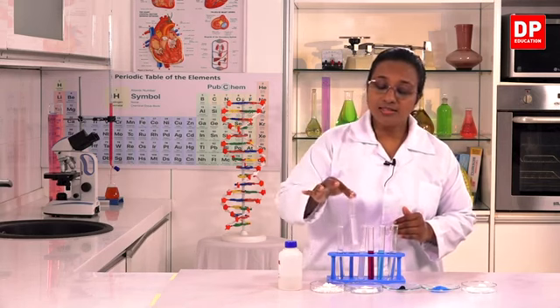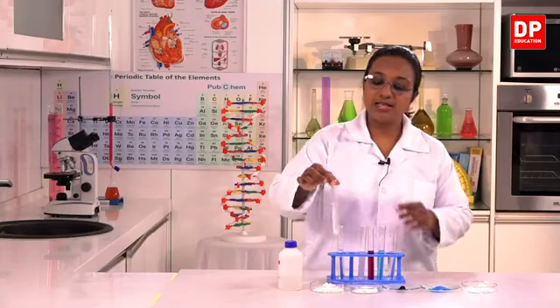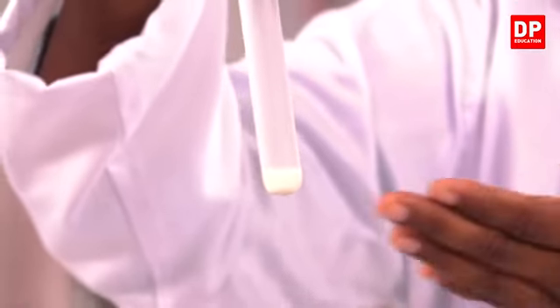We have the other solid, that is wheat flour dissolved in water. Here again you can see at the top it's almost clear, and towards the middle part of the mixture you can see there is a pale color, and at the bottom you can clearly observe that there is a solid substance present.